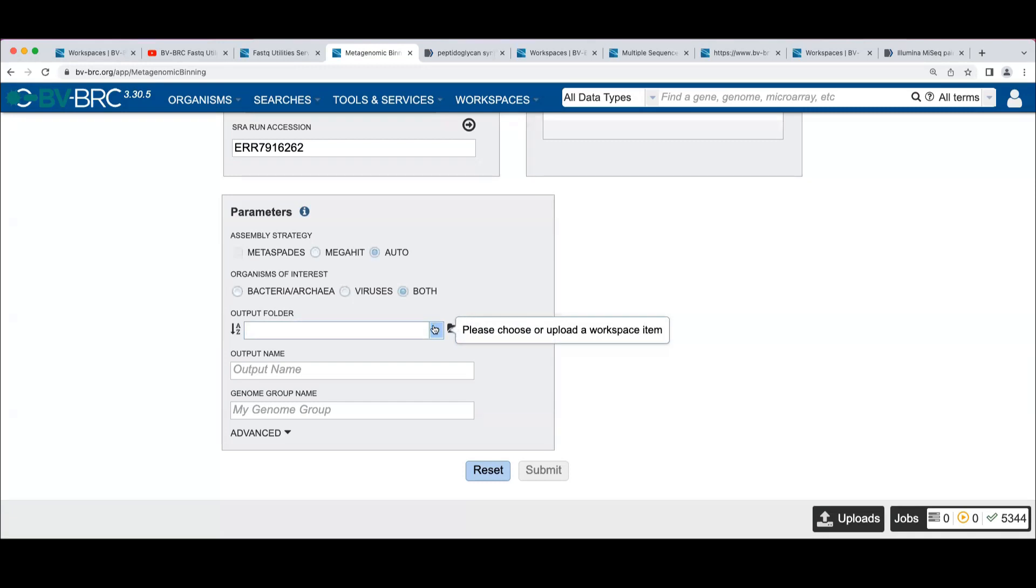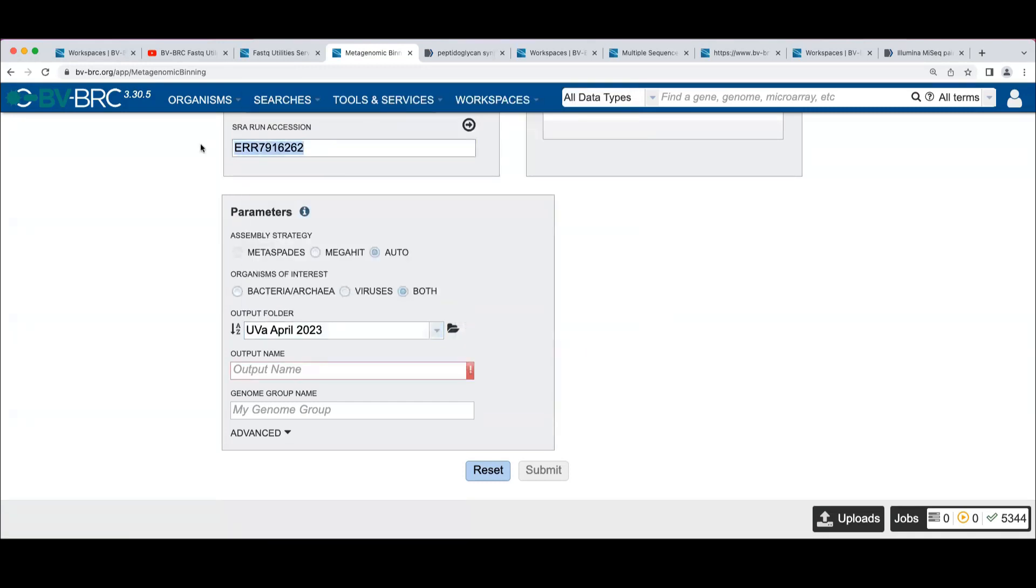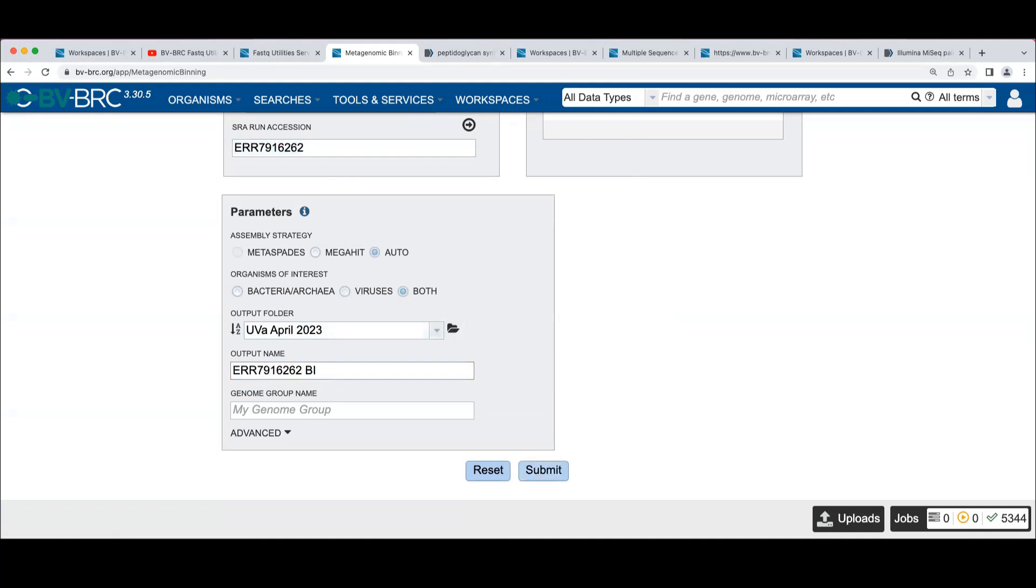Your output folder, we'll name it as we named it before. So there's another option here that we haven't seen before, which is a genome group name. Remember, genome groups let you group genomes together for easy reference.